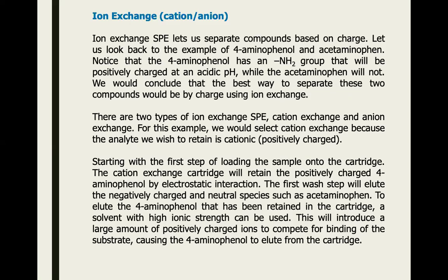Okay, the next one, which is the last one, is ion exchange. Usually this is a bit difficult because the resin requires special ions on top of the solid phase adsorbent. You need to have a cation or anion on the surface of the adsorbent. So ion exchange SPE lets us separate compounds based on charge.